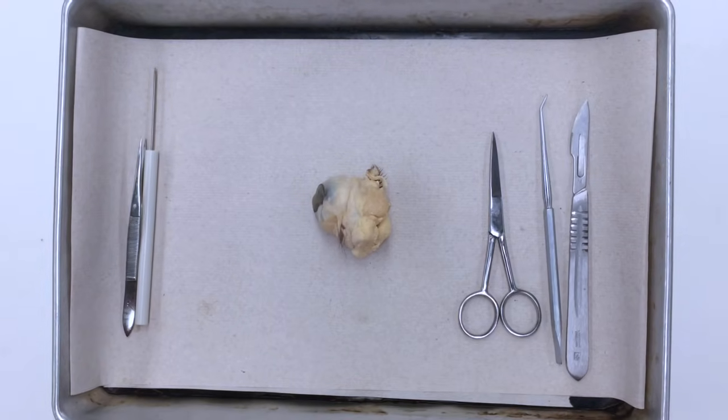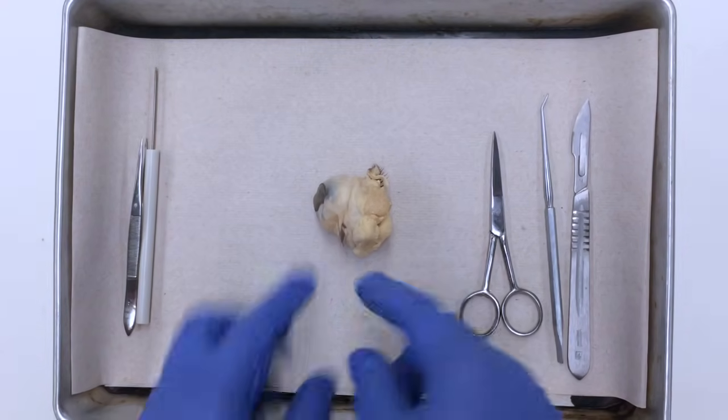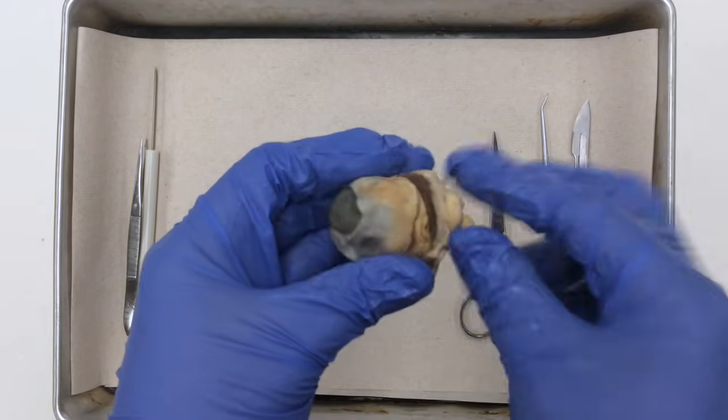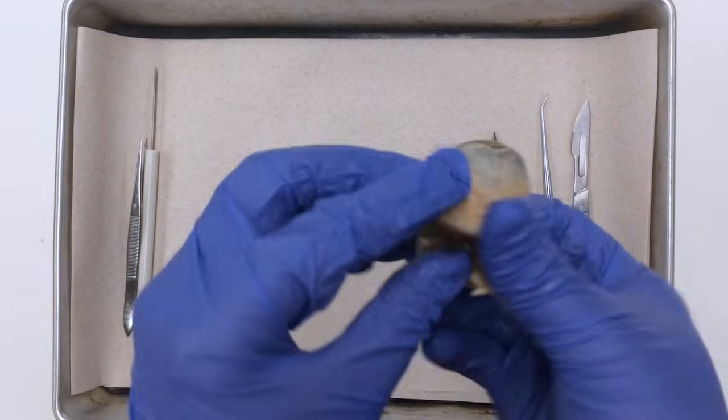Today we're going to be dissecting the sheep's eyeball. Notice the sheep's eyeball contains a lot of fat around it, along with eyelids and eyelashes.